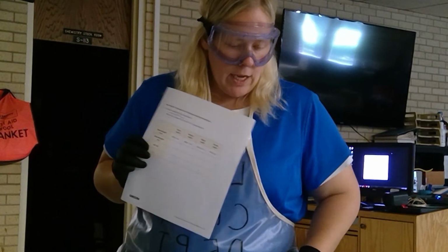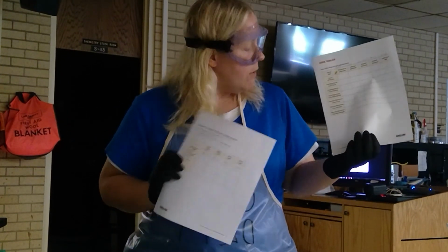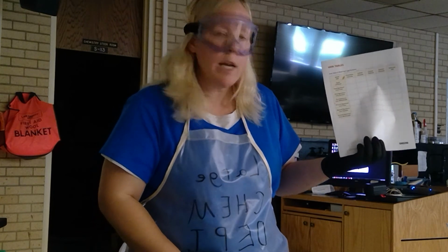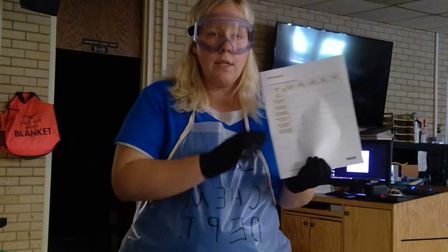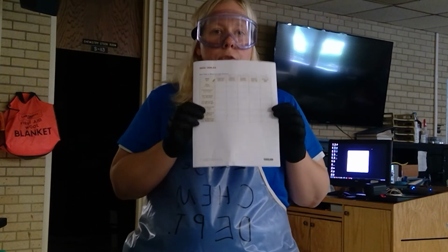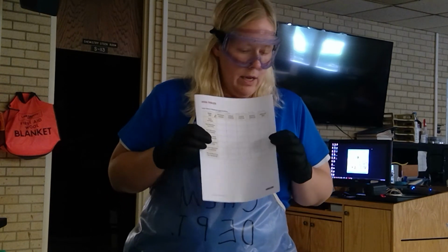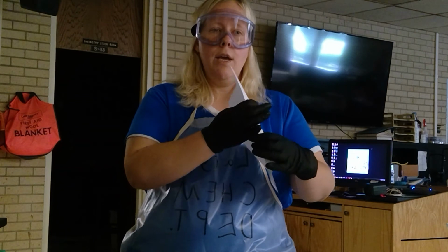Again, on data table 3, you're going to find the spectrum line numbers for this table in your lab. It'll be towards the top of your experiment, so you will be able to find them easily, but you will need to tell me what color of line these correlate to. So if you have any questions, please feel free to email me through Canvas, and I will be glad to help you. But good luck until next time.